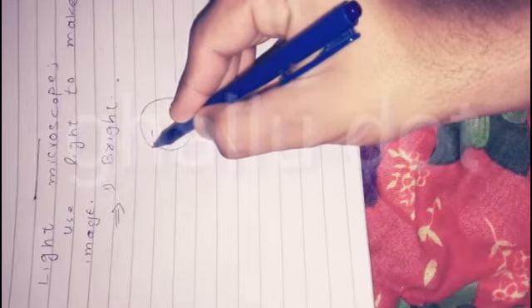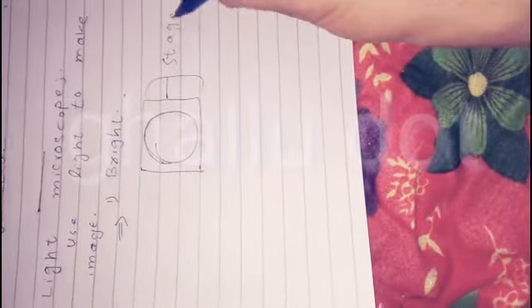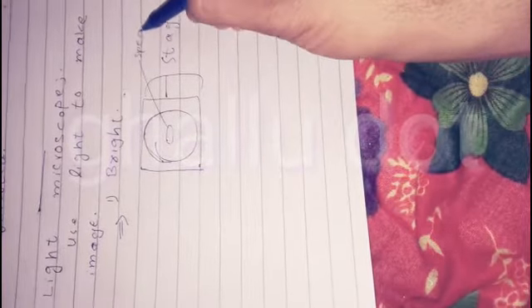What is the bright field microscope? Here is a stage of a microscope where an object is placed, and light from the light source will focus on the whole stage.